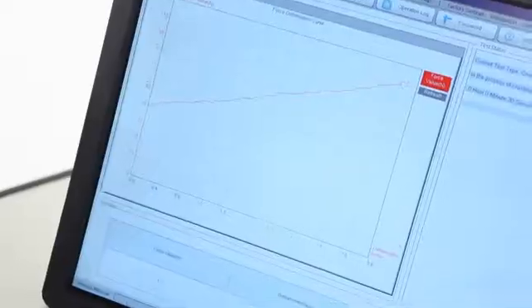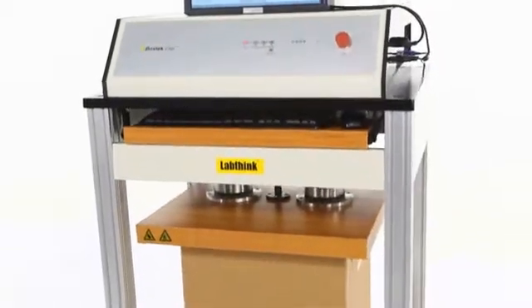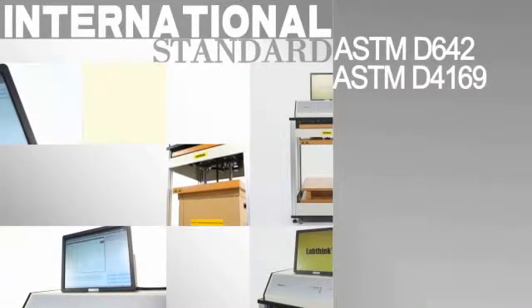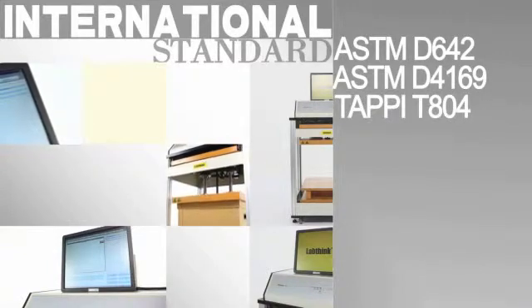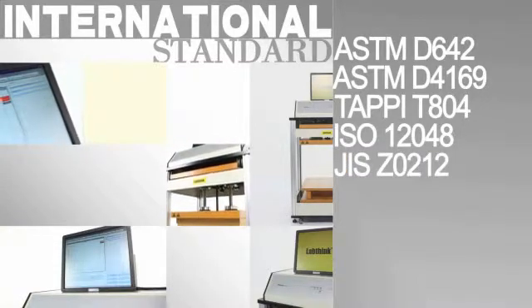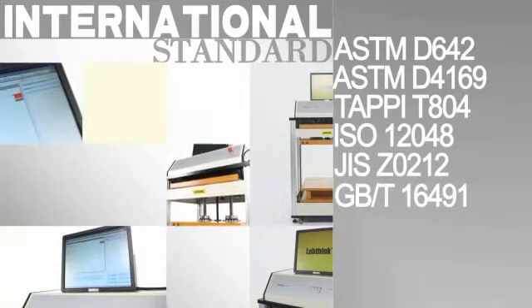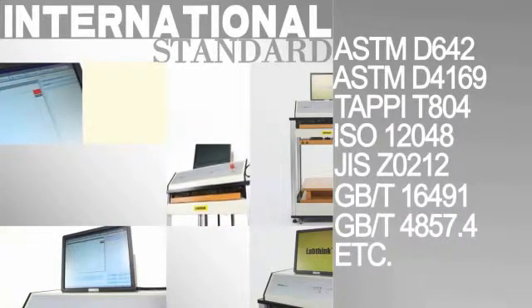iBoxTech 1700 is equipped with a standard LCD screen and embedded computer control system, which can display the test force, deformation, and other test information dynamically, guaranteeing the security of the system and data. The instrument conforms to ASTM D642, ASTM D4169, TAPPI T804, ISO 12048, JIS Z0212, GBT16491, GBT4857.4, and other standards.